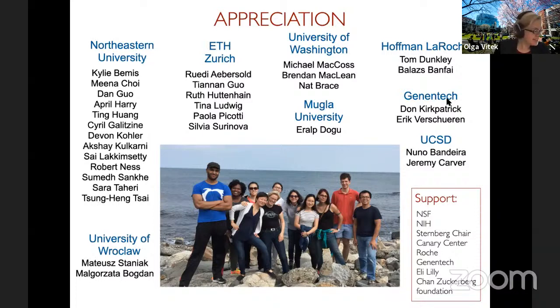So now let's see if there are any questions that I can answer. So there is a couple. Can you comment on the effect of carryover on blocking design to include blank runs, etc.? I think this is very specific to your workflow and the nature of the samples. Carryover will be a problem for every experiment, blocking or no blocking, right?